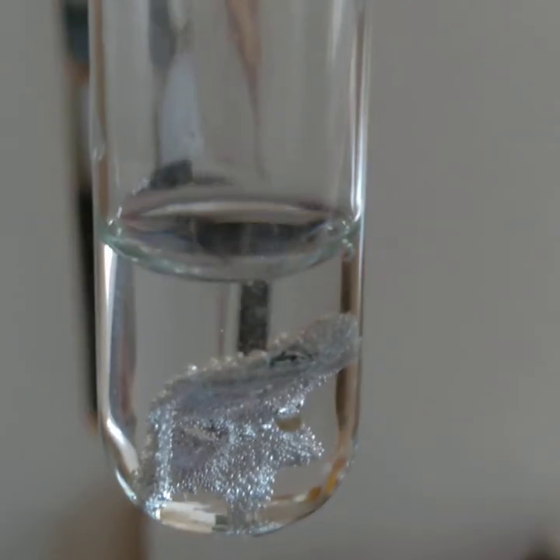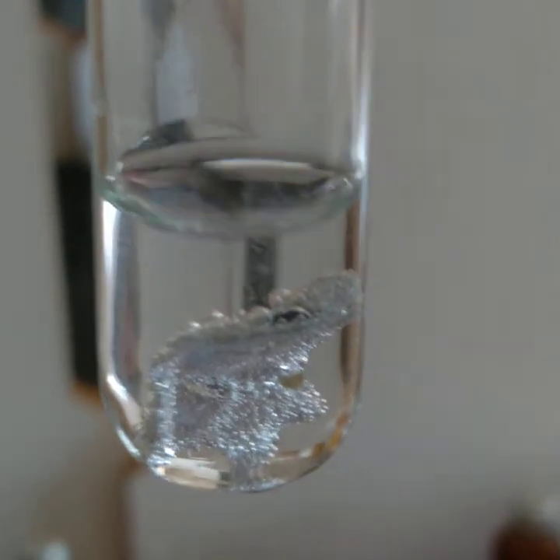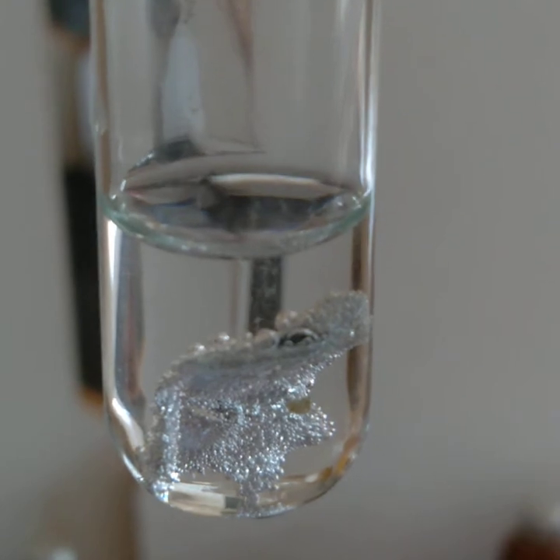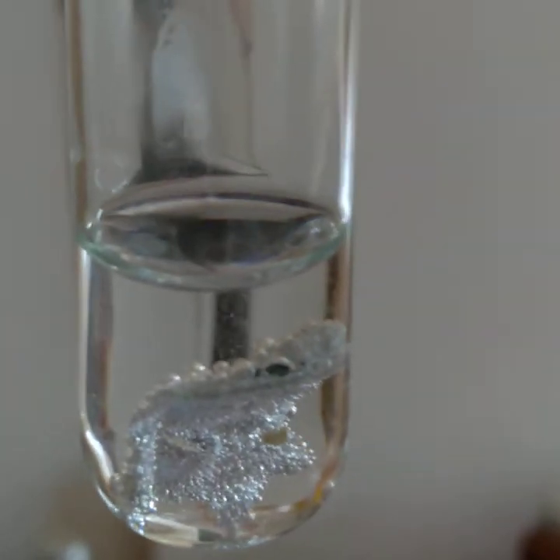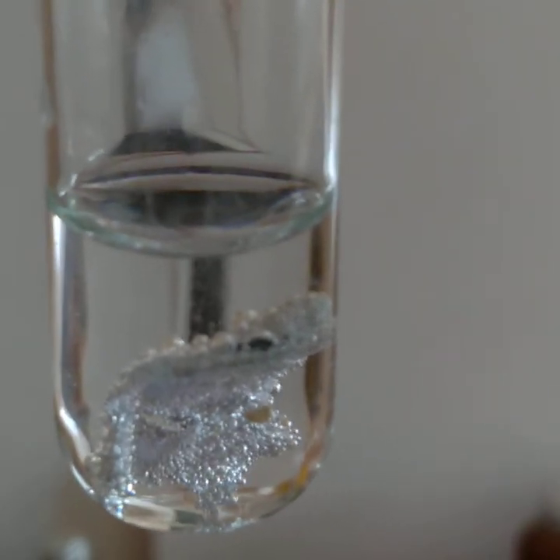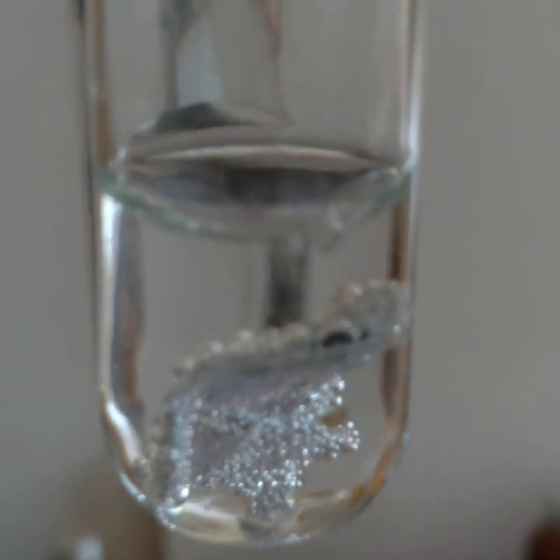What is actually happening there? Zinc metal reacts vigorously with dilute HCl. Zinc plus 2HCl gives ZnCl2 plus H2 gas. Which gas is being liberated? Hydrogen gas. We call it H2 gas, hydrogen gas.